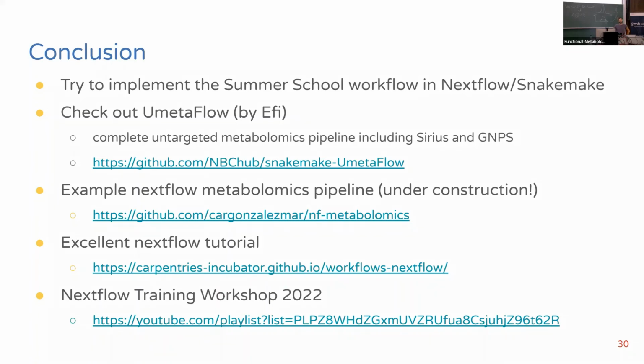And I would say it's just more reproducible. It's way easier to get with one click to the same results than if someone forgets one parameter, forgets one step, or does it in the wrong sequence, and it's all different. And you could have an expert level where you would modify the parameters file, or an easier mode, right? That's also possible.